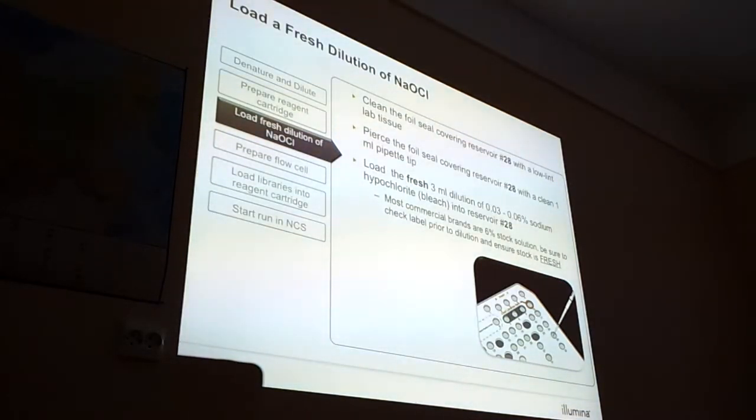It's exactly the same. And this is the concentration for the wash solution, between 0.03 and 0.06%. Really be careful not to use the wrong concentration. If it's very highly concentrated, it can damage.